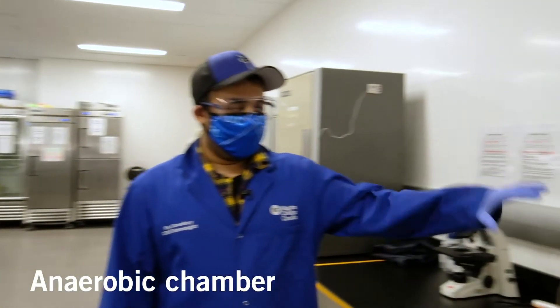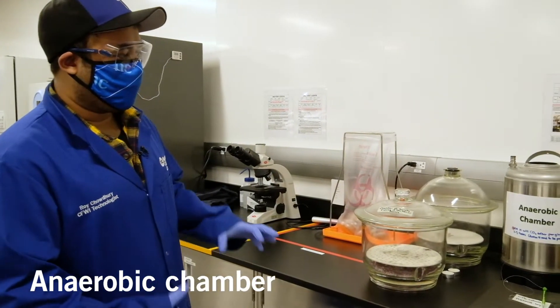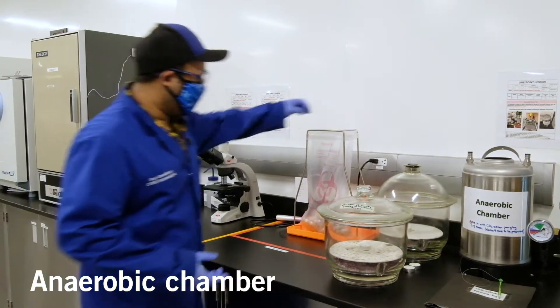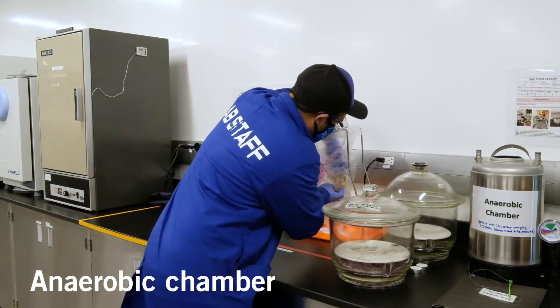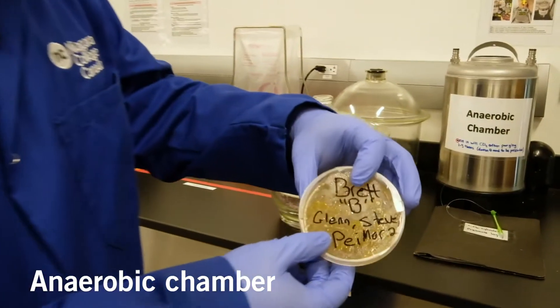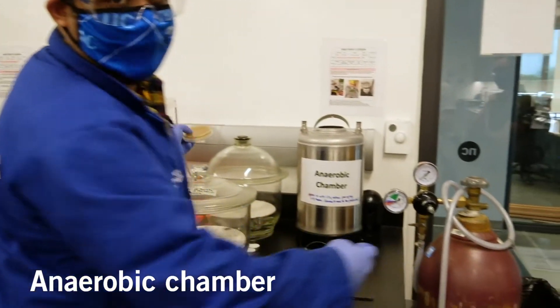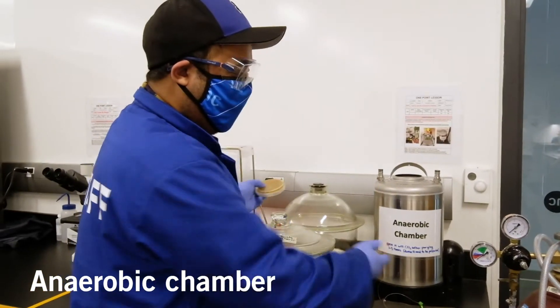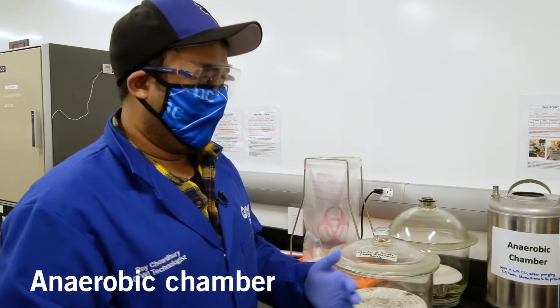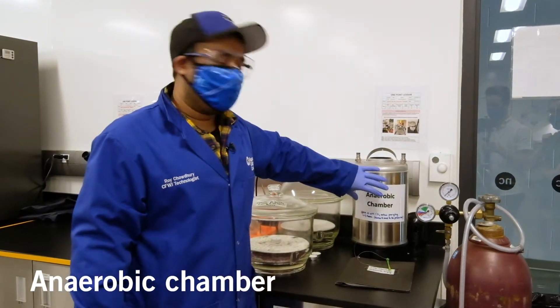First things first, we have the anaerobic chamber here. This is used by a majority of the brewery students. They use it to create and grow their starter cultures or any kind of microorganisms grown on these plates. Students streak on these growth medium plates, place them in the anaerobic chamber, seal it off, and then turn on the CO2 gas. This way there's no oxygen present, and the microorganisms grow well in the absence of oxygen. Only carbon dioxide gas is being fed into this anaerobic chamber.